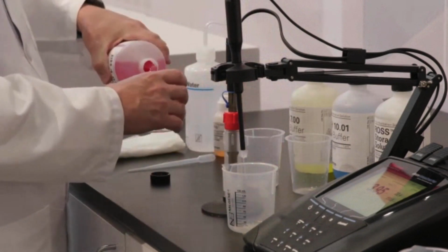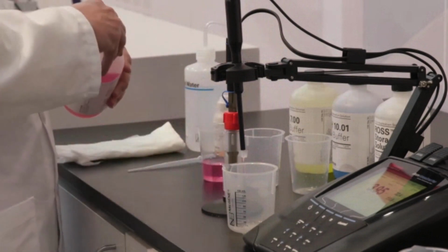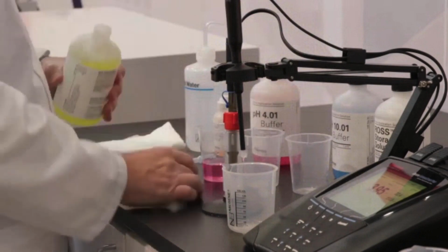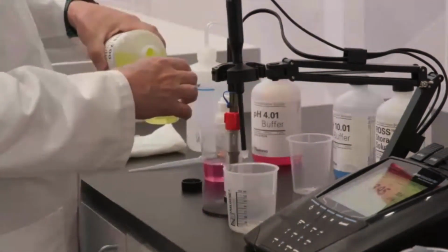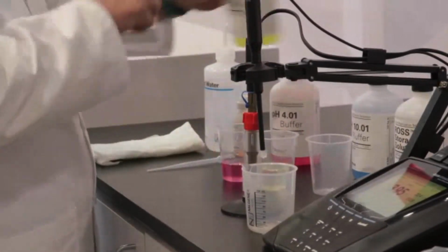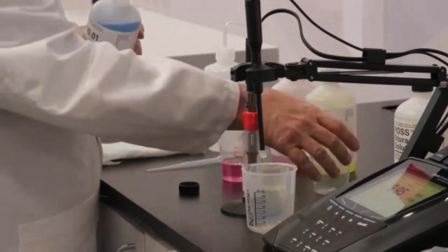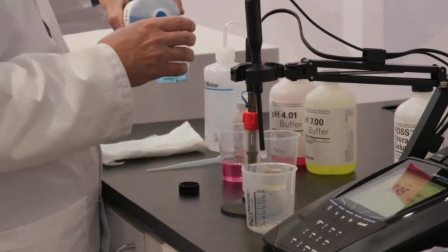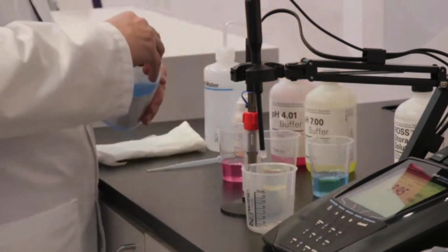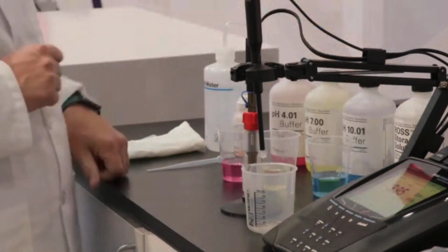So we are going to do calibration at pH 4, 7, and 10. And Steve's going to pour fresh buffer so that we can get our best calibration. After he's poured the buffer, we'll show you the proper way to remove the electrode from the storage sleeve. This will be a tip that's especially good for sealed gel-filled electrodes.